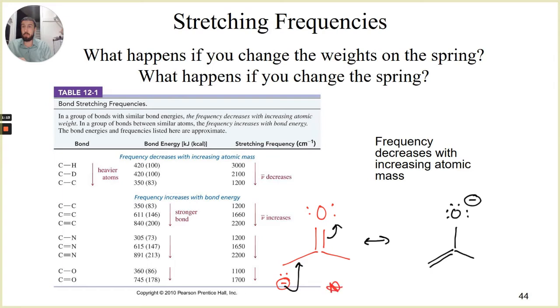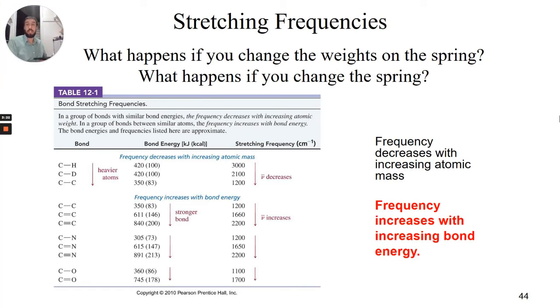Well, the red one is still our preferred structure, but the value where that carbon-oxygen double bond appears is going to shift to lower frequencies because that resonance weakens the bond. So resonance can weaken that double bond, making it show up at slightly smaller values, which becomes one of the interesting things that I pointed out already when we talk about IR as a big overview. We don't want to memorize the absolute values of these things because those values will change when we change our structure. If we're aware of what things can cause those changes, we can start to predict where things might shift or slide if we had things like resonance or other contributing factors.